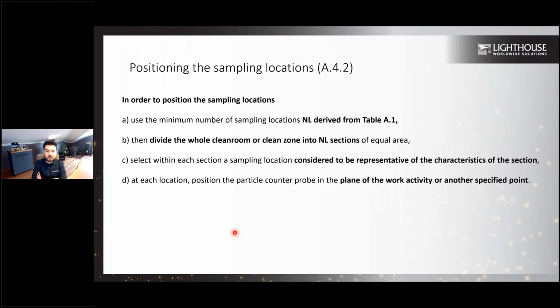Within the zone, you should define all the risk aspects, and then you can select the right location. What if you select right in the middle of this zone? Nothing. If you are able to explain why you picked this location, then we are all fine with it. But if not, then you're just taking a sample from the center, still okay, but not a good practice.